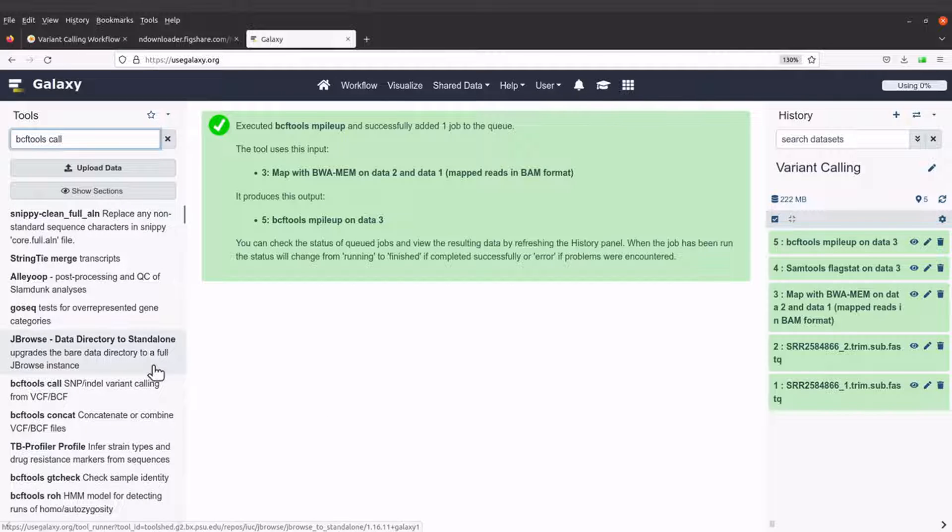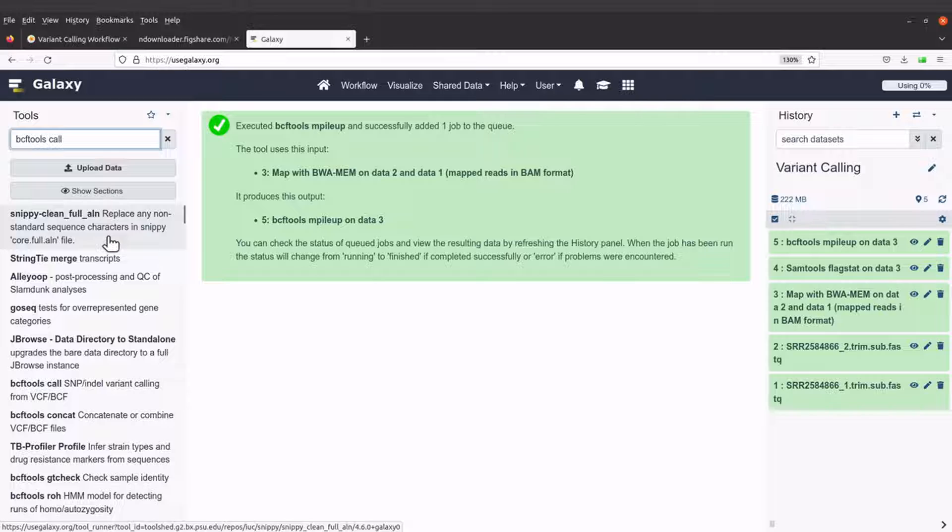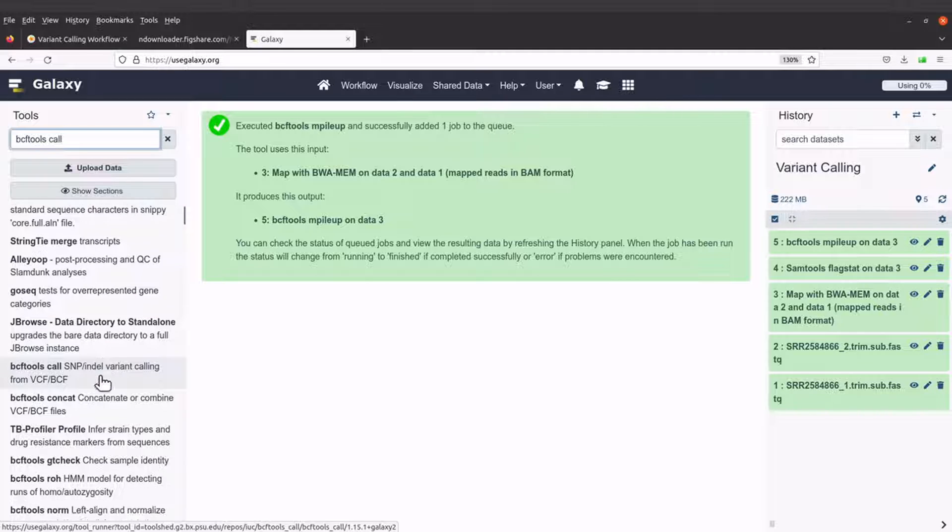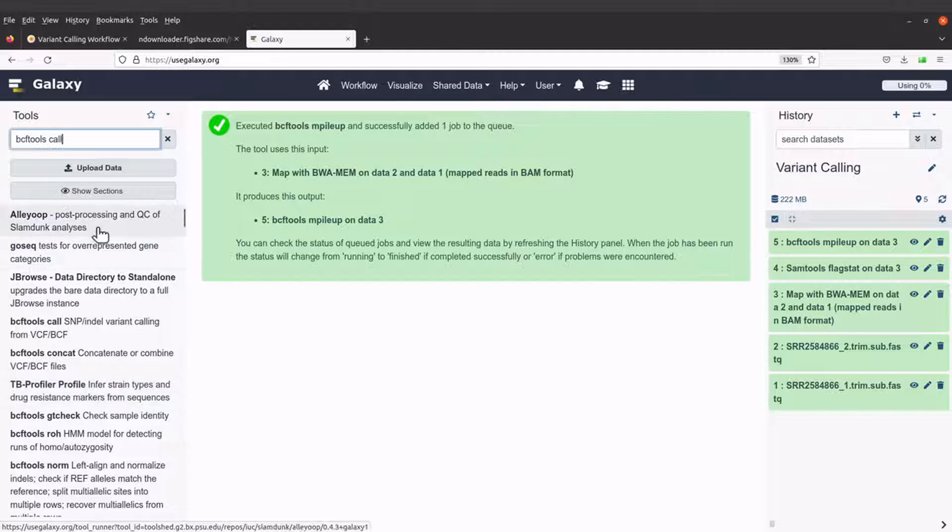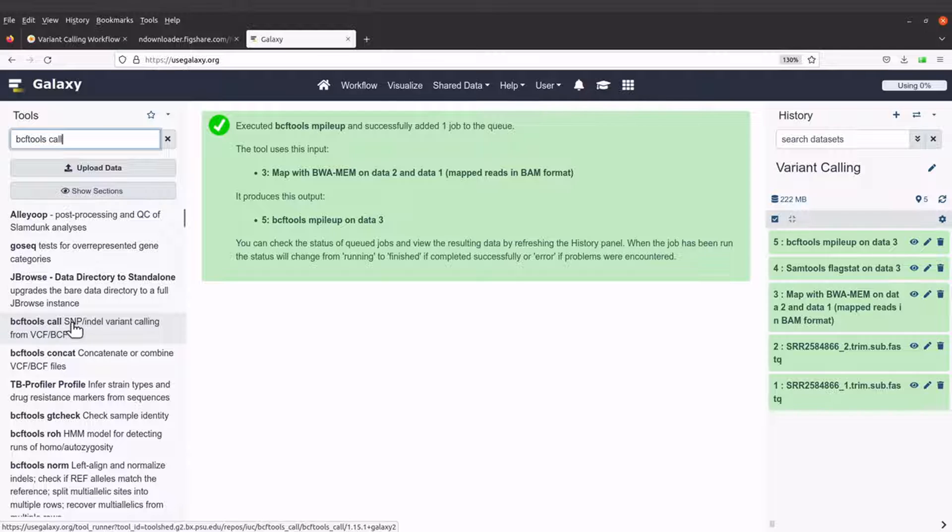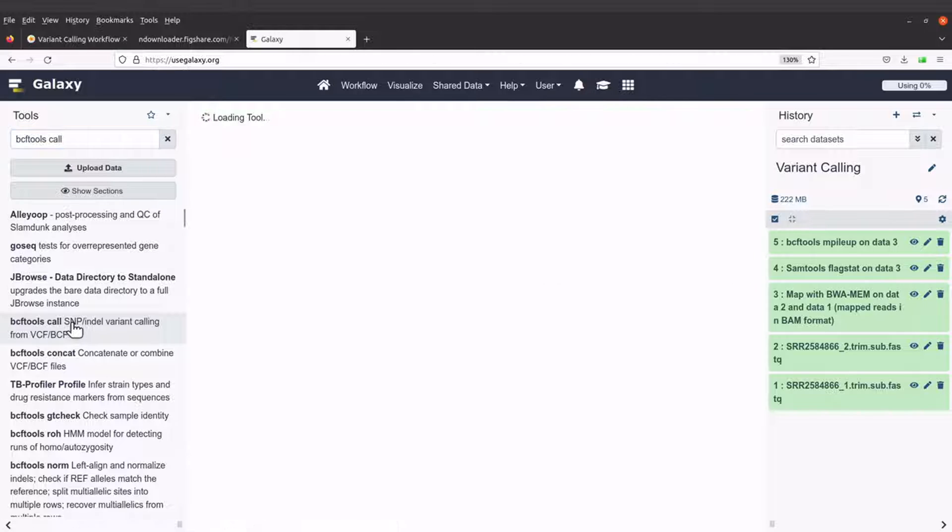So I will search for bcftools call. It should show up soon. You can also scroll down to check where it is. I see it here. This is bcftools call. So I will click it.